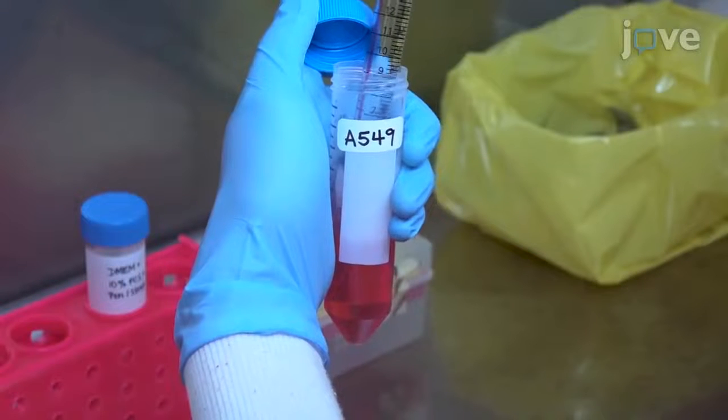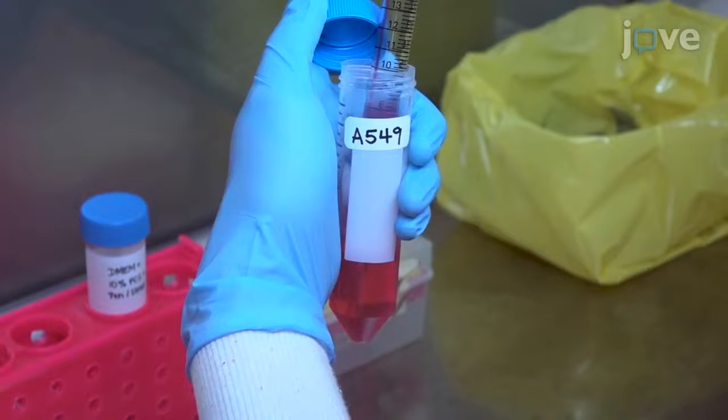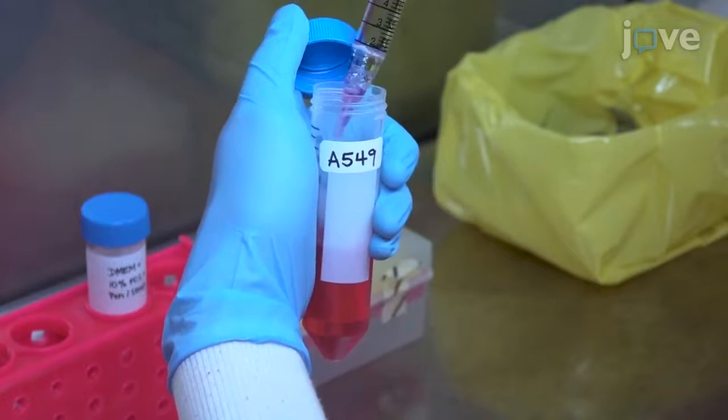To seed plates on day one, first re-suspend A549 cells in DMEM media with 10% FCS and 1,000 units penicillin streptomycin mixture at a concentration of 400,000 cells per milliliter.